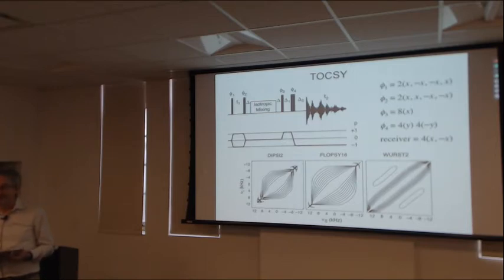So again, that point in the beginning, one's just modulating the duration of an individual pulse before you change the phase. And now you say I'm looking to modulate the amplitude as well as phase, one can potentially gain more control over the system.